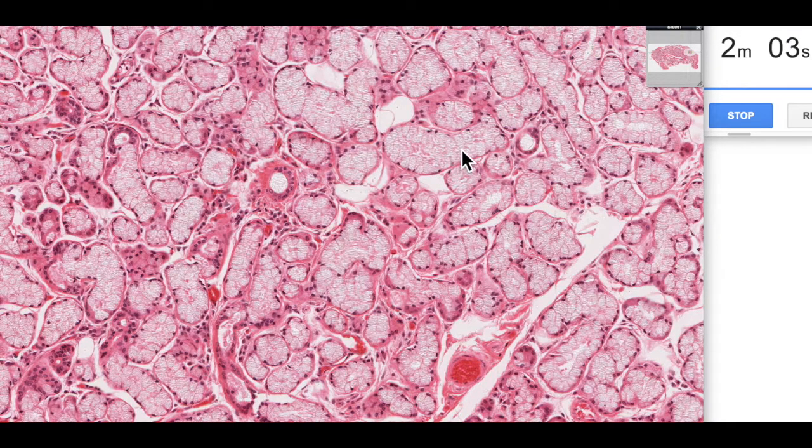They have the typical sort of mucus acinous type of appearance with basally located flattened nuclei and then most of their cytoplasm actually are relatively unstained. It's sort of this glass type appearance. And that's because mucus is a very glycosylated glycoprotein.